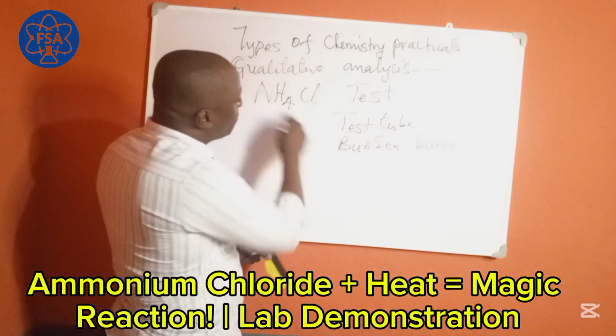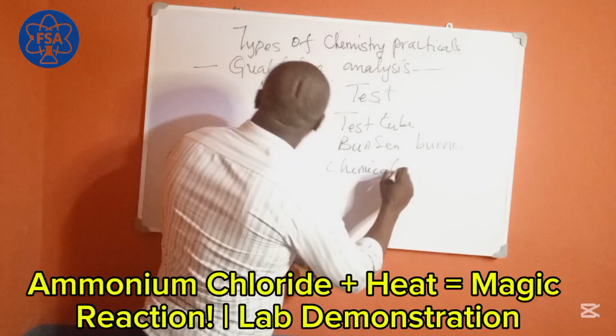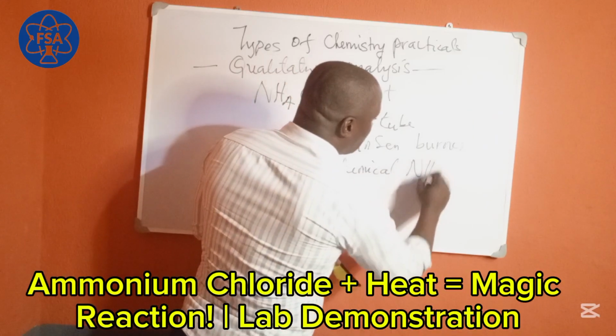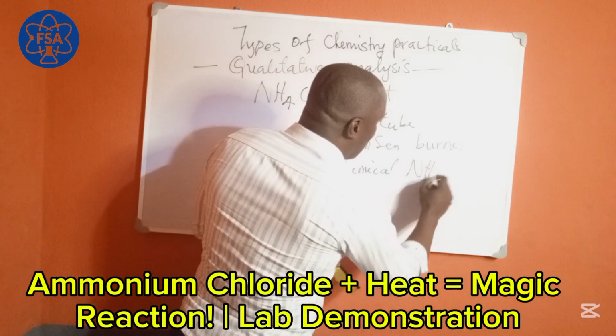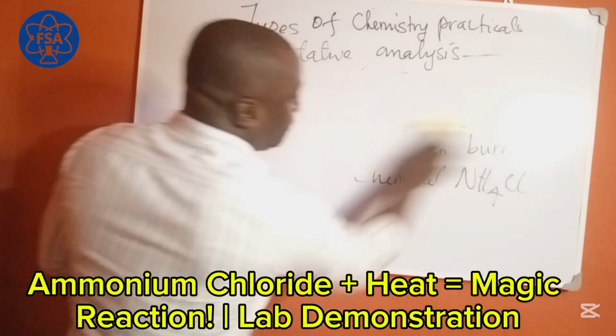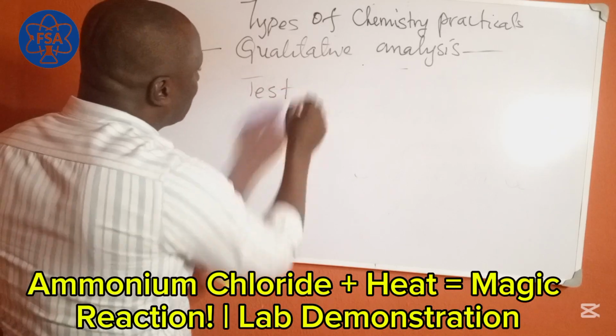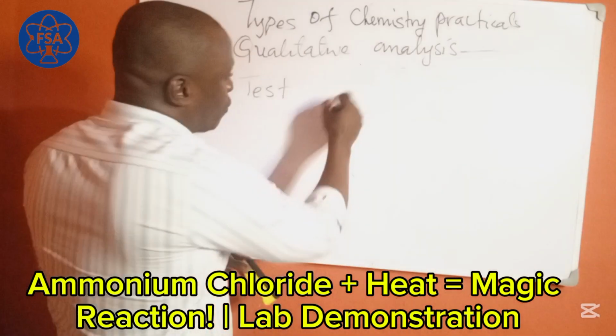The chemical we are using in this particular analysis is ammonium chloride. On that test, you now add your salt.